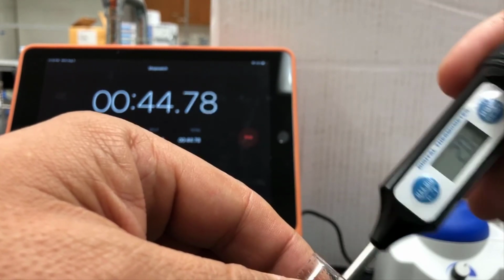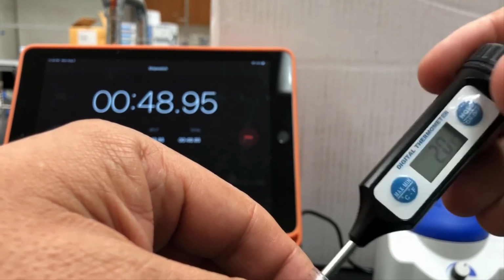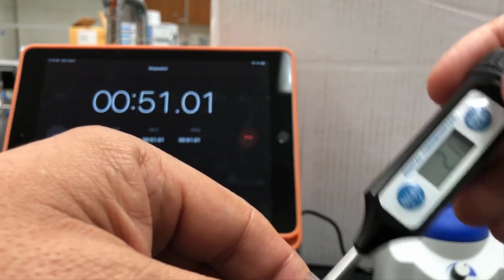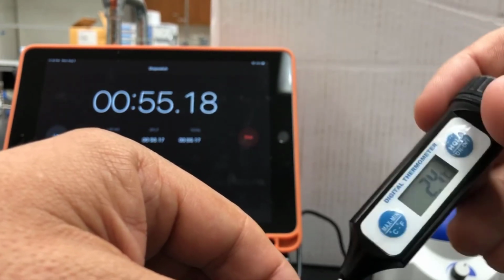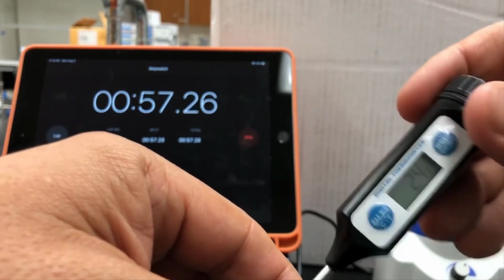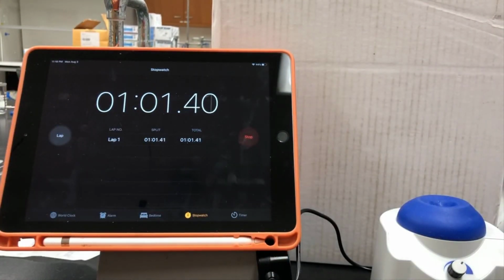And to think about what's going on, it's heating up in the air, plus the thermometer has to cool down, so they're going to meet somewhere. So really the lowest temperature is probably a little bit lower than that. But yeah, 1.7 seems like a fairly reasonable number. All right, so go back in the video. You can get your time for that temperature. And you should be able to construct a reasonable Arrhenius plot from the temperature data that we were able to obtain with a catalyst.